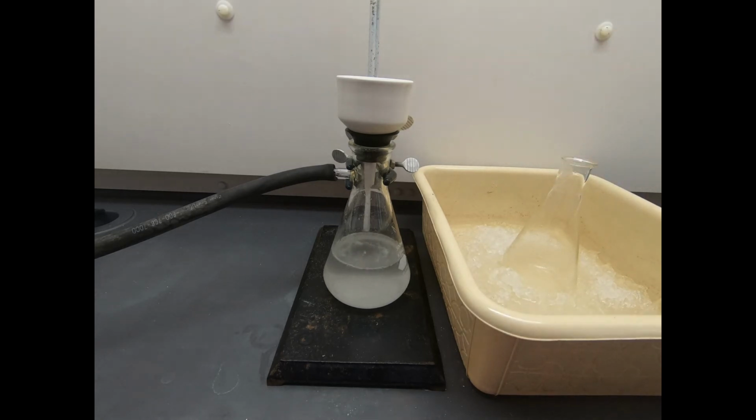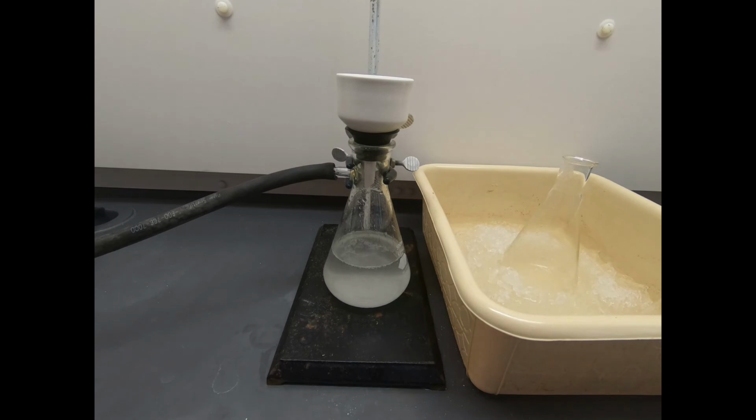I'll transfer it to a watch glass, a tared watch glass, so we know the mass of that watch glass, and then we'll be able to determine the mass that we've added to it through the solid, and we'll be able to determine a yield. So you can see now it's sputtering, so all the liquid is through, but we'll let that keep drawing air through the solid so that we continue to get some drying.